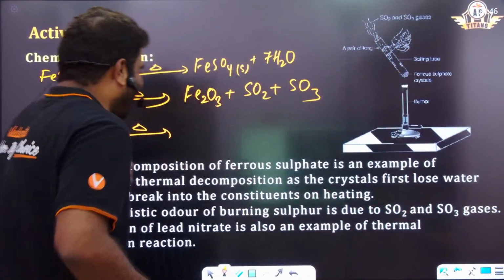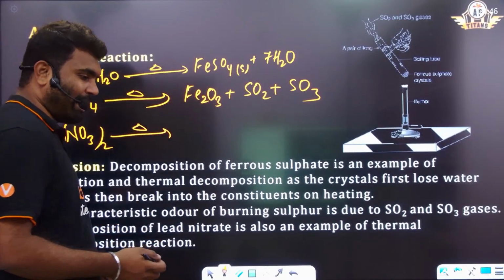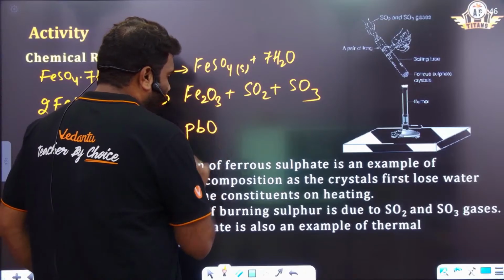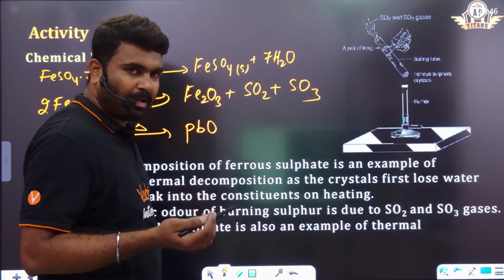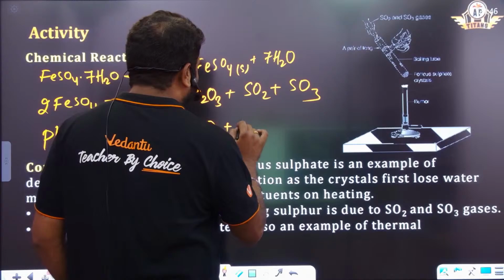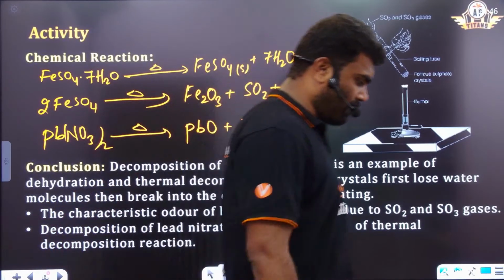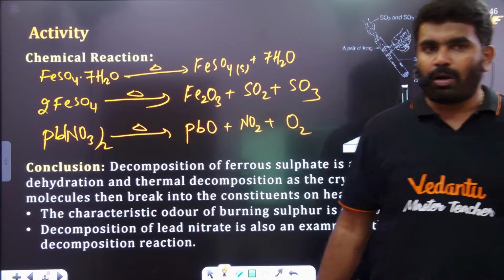రైట్, ఓకే. సో PbNO3 టేకెన్ వైస్ ఉంది కదా ఇక్కడ. సో Pb లెడ్ ఆక్సైడ్ అనేది ఫామ్ అవుతా ఉంది. దాంతోపాటు ఏమొస్తుంది బేటా మనకి నైట్రోజన్ డయాక్సైడ్ వస్తూ ఉంది, దాంతోపాటు ఆక్సిజన్ కూడా వస్తూ ఉంది. నైట్రోజన్ డయాక్సైడ్ అండ్ ఆక్సిజన్ అనేది రావడం జరుగుతూ ఉంది.